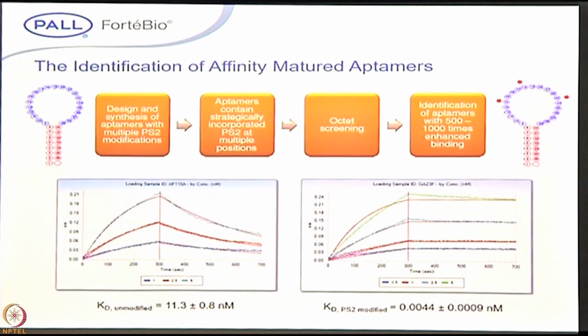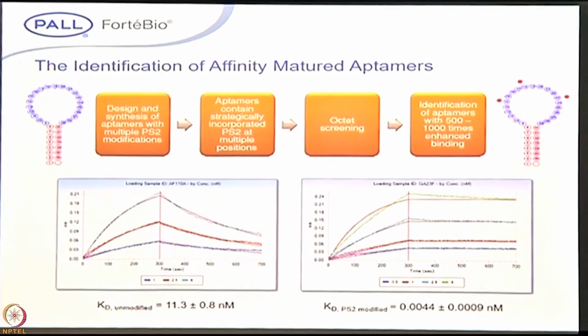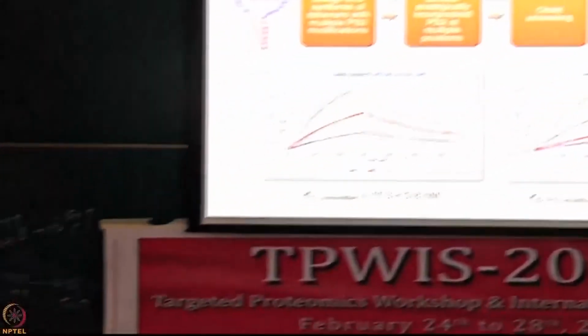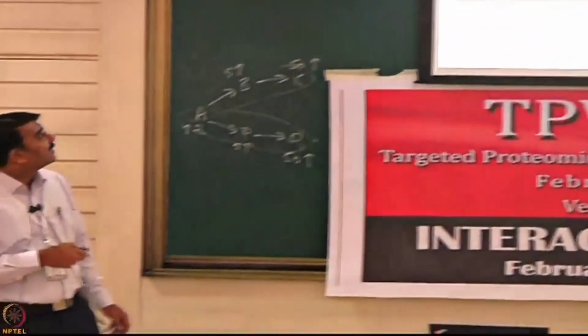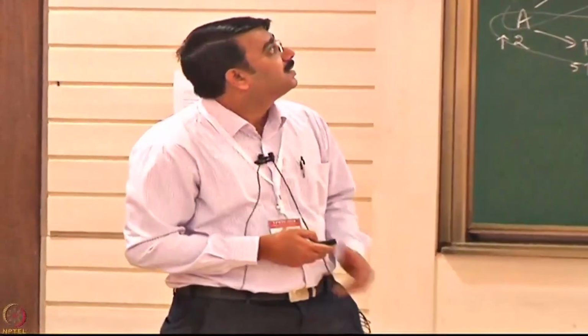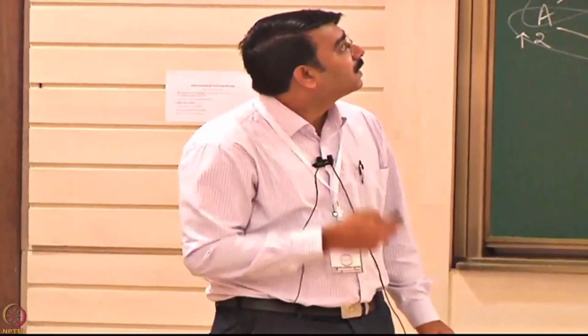Then aptamer screening. Aptamers are an area that is picking up now in comparison to antibodies. Many laboratories in India are working on aptamers. Aptamers are similar; they have different sizes and shapes, and when they bind to a particular target, you can see the response. Aptamers also have a major application in diagnostic industries. So you can quickly screen using aptamer interaction studies with BLI technology.